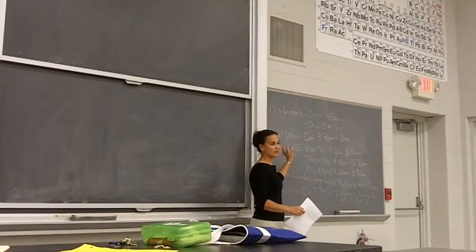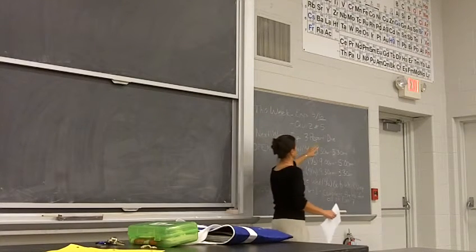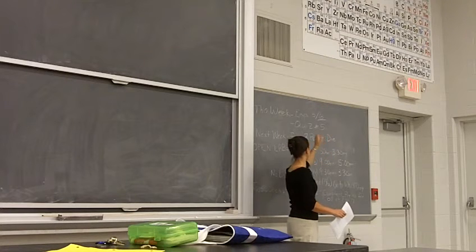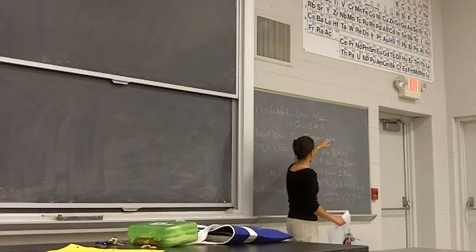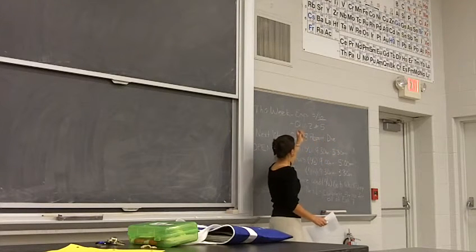On your syllabus it has experiment 5 and 6. The doing in lab is experiment 6 for the most part. Experiment 5 is about IR spectroscopy, which we'll talk about here in a little bit, and it gives you the instructions for collecting spectra. But the actual doing the experiment is experiment 6.